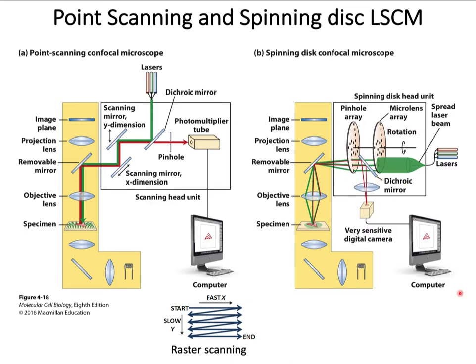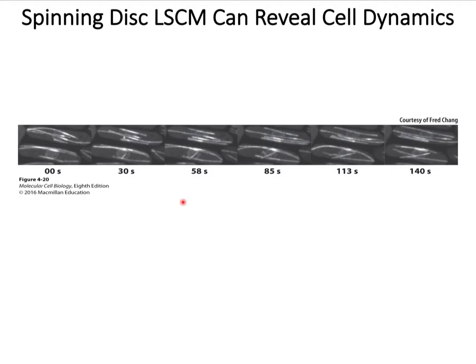recorded. So spinning disk confocal microscopy reveals dynamics in 6 frames of a movie of microtubules in 2 rod-shaped cells expressing GFP tubulin. So take a look at the middle of the elongated bottom cell at the 0 second and then toward the top of the cell.